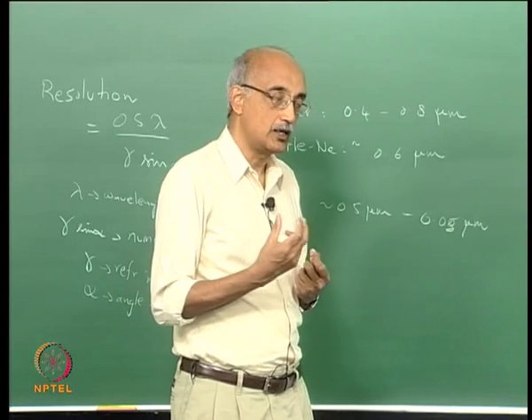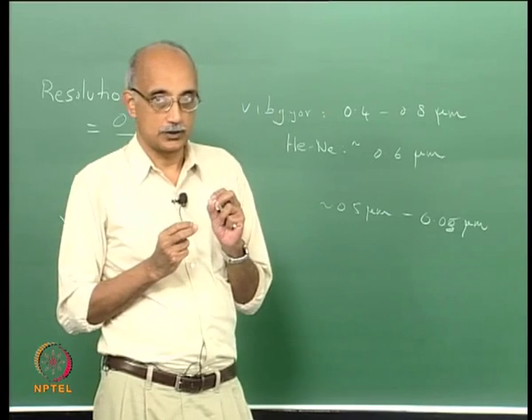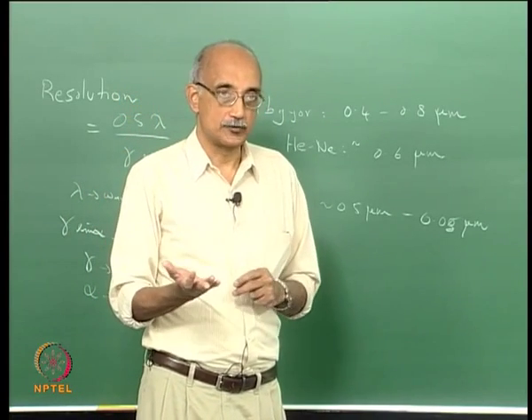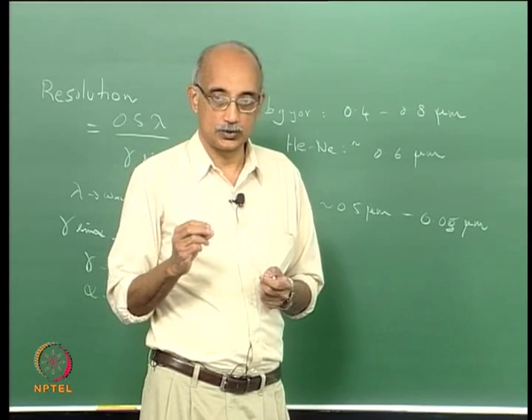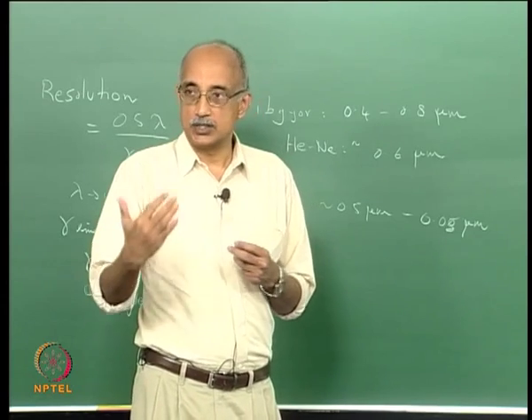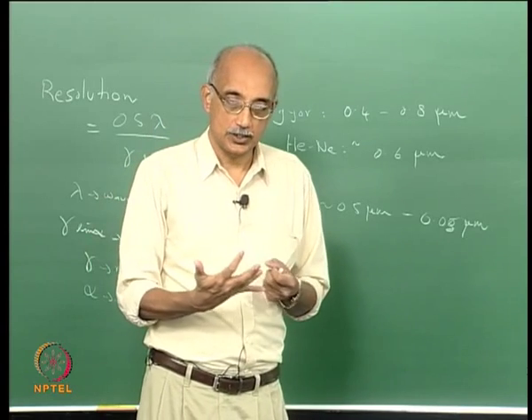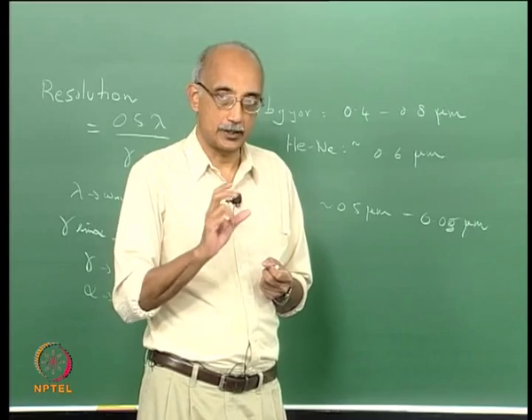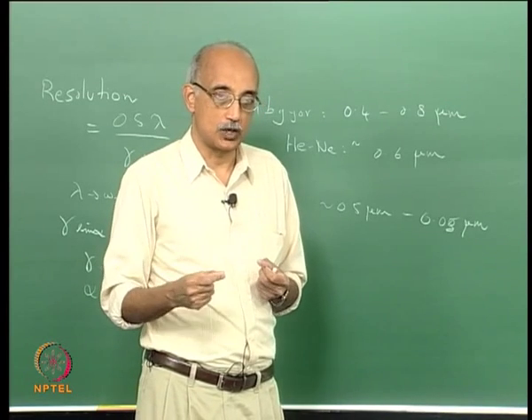So, in many corporations, the quality of water with respect to suspended particles is specified in terms of turbidity. The turbidity of water that is used for, let us say, domestic usage cannot exceed a certain value, and the reason that it is specified in this fashion is turbidity is a measure that corresponds directly with the concentration and size distribution of particles in water.